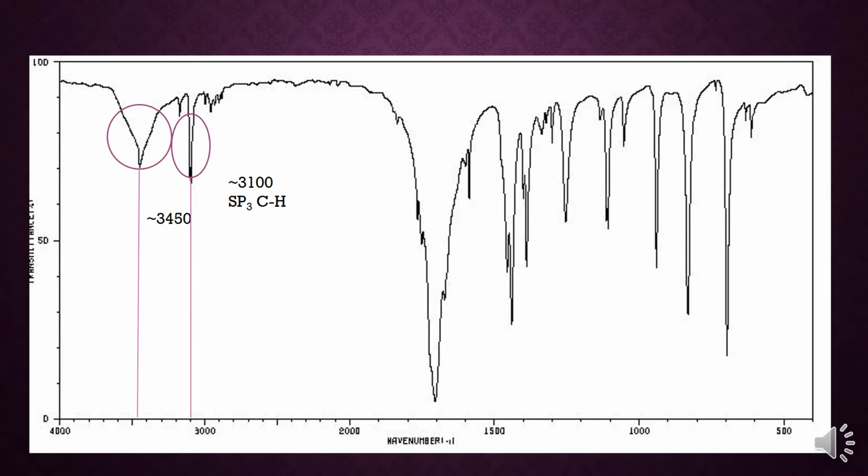Now if you look in our carbon-carbon triple bond region, you'll notice that we don't have many peaks in that area. A couple of small ones, but nothing particularly noticeable, so it's highly unlikely that we have those in our structure. But if you look in our carbon-oxygen double bond region, or zone 4, you'll see this massive spike in absorbance. Now what this means is that it's very likely that we have multiple carbonyl groups within our structure.